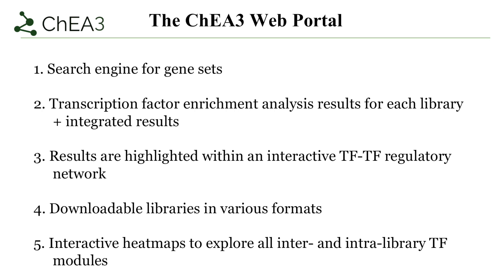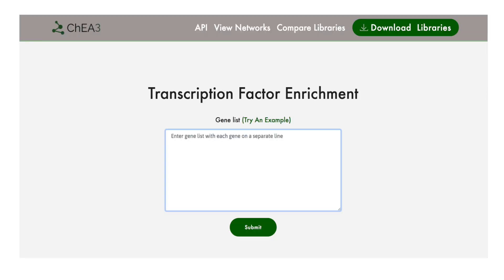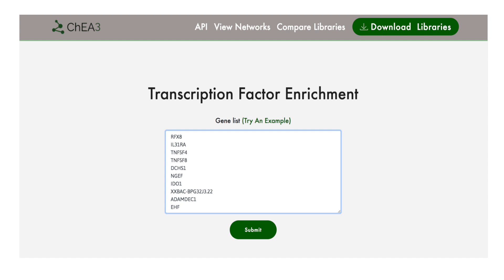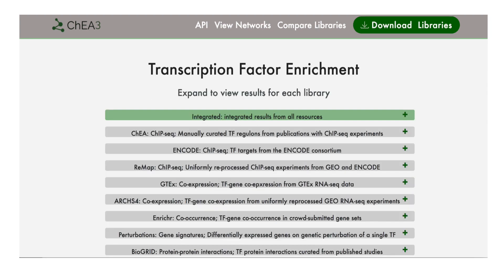Using the example seen in the previous slides, we can use that same gene signature to identify the transcription factors responsible for the associated changes in gene expression. Here's the home page for CHIA-3. The gene set is entered with each gene separated by a new line, and then the user submits their gene set. CHIA-3 organizes tabular output of the transcription factor enrichment analysis with each transcription factor sorted and ranked by p-value.